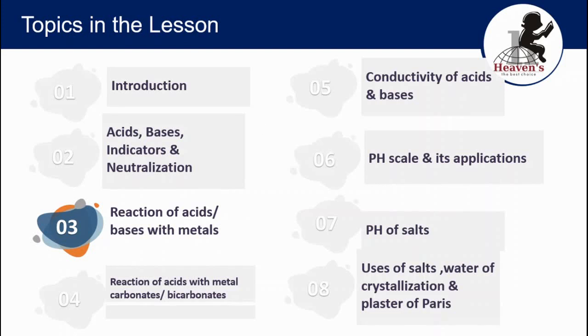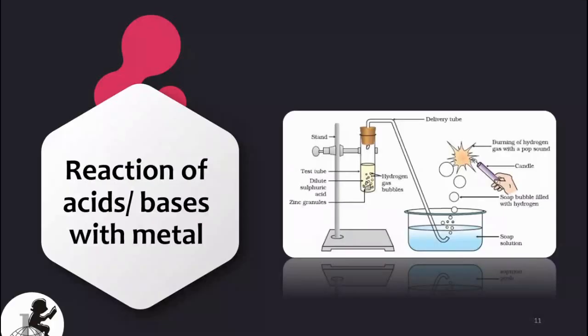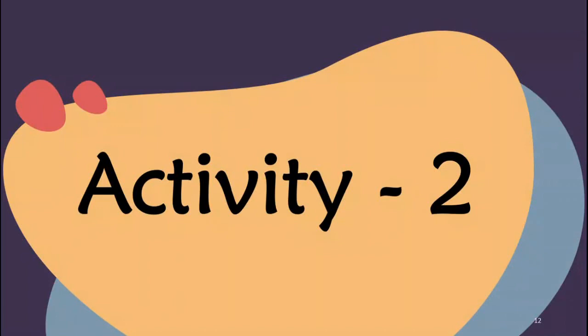Morning guys, and the next topic is reaction of acids or bases with metals. Let us go to the activity. Reaction of acids or bases with metals. So see the experimental arrangement. Here, this is activity 2.